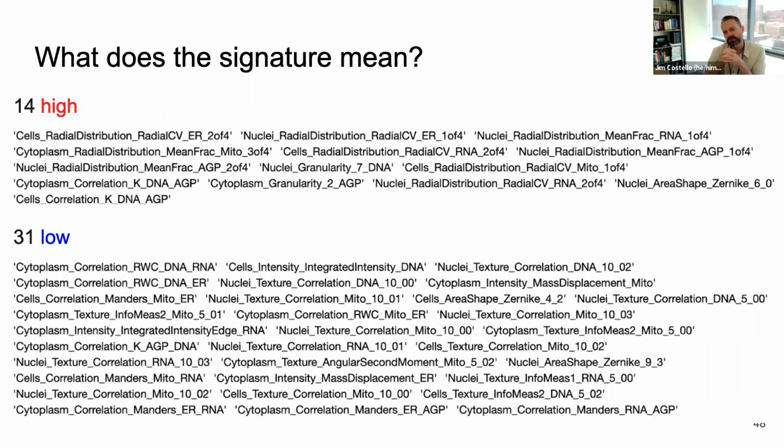Just a clarification: from everything that you showed, these are just general organelle stains using the Cell Painting kit, is that correct? For the two examples that I showed, yes, but we're definitely not exclusive to Cell Painting. There are other kinds of assays. We're particularly interested in live cell imaging, and there are live-cell compatible dyes. We can also just use generic bright field imaging, and depending on the tissue condition, you could apply these types of approaches to tissue. But like I said, there's probably going to be a whole host of other challenges.